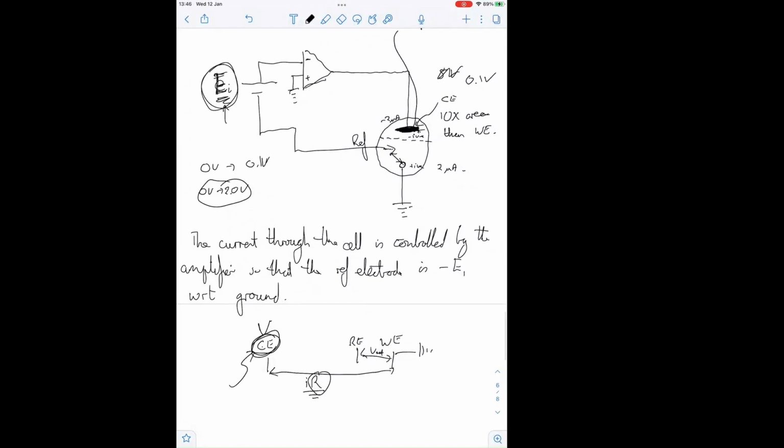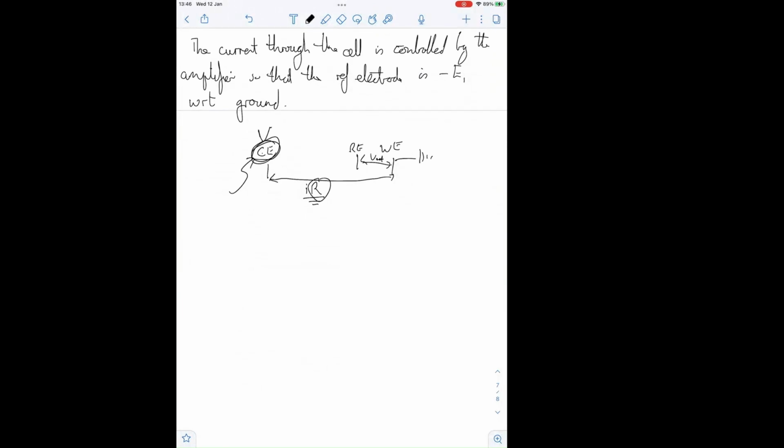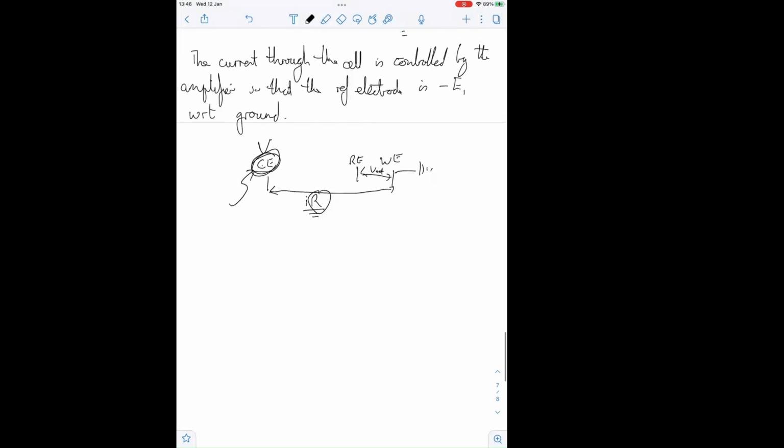If you're ever purchasing a potentiostat, think about what experiments you're doing and what compliance voltage is required. And do a cost analysis, because actually the bigger the potentiostat, the more you're going to pay for it. Okay, so let's just, so VO load, there is always going to also be some IR drop here.